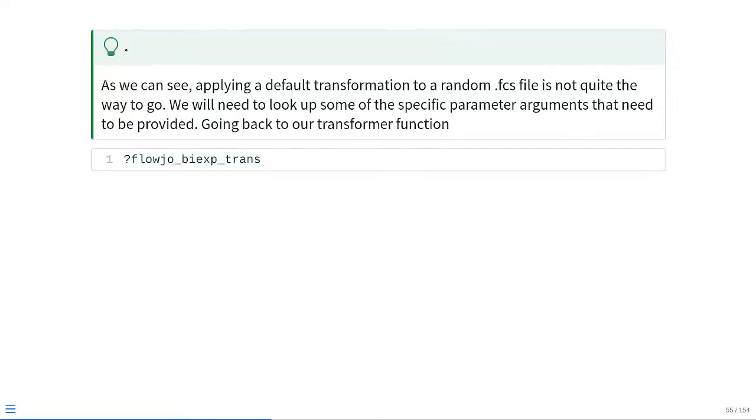So one thing that we can do is check to see what our transform function options are in terms of the optional arguments. See what the default values are that are not quite working in this case, and then figure out by tinkering around what do we have to do to actually get them into place. So as we're always trying to do, if we need to find particular information about a particular function, we can use the help file. So if you're within Positron, you can just hover over the function name, or if you're working within your console window, just add a question mark in front of the function name, and this will be able to go in and look up that particular set of information.